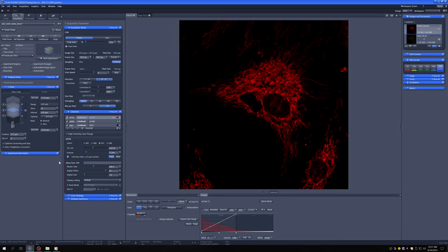And now to acquire the Z-stack, we're going to click on Start Experiment. Now notice, before I do that, one other thing, which is that you have this option to do all tracks per slice or a full Z-stack per track.